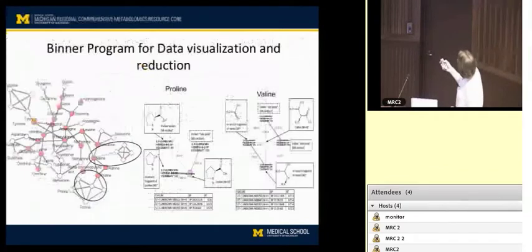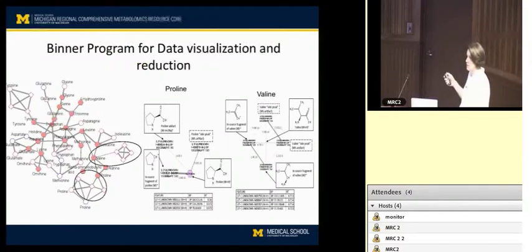I'm sorry. Okay, well, let's just talk a little bit about, so you saw the slide where we talked about how maybe as many as 60% of these compounds may be considered redundant features. They're features that represent the same thing. I think part of the way we originally found this was through Alla Karnowski's work and George.